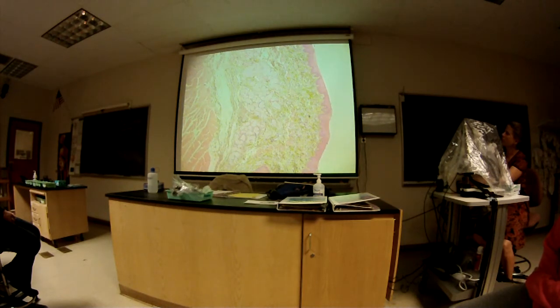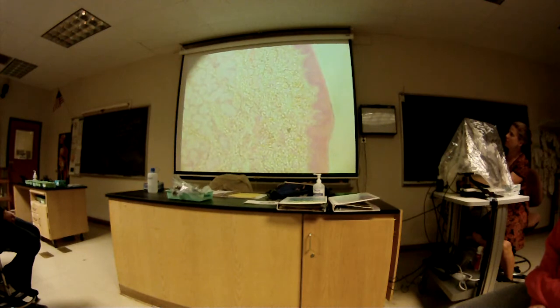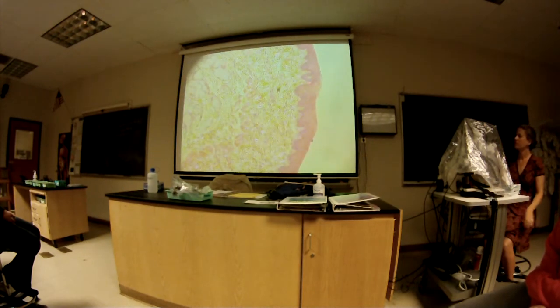Okay, so we're a little far away to tell yet what this epithelium looks like up here, but you could probably tell that it's stratified. So let's just get a little closer. Because what's the only organ that we studied on the slides that has the non-keratinized stratified squamous? This one, the esophagus. Yes, this is esophagus. And so here you can see your noteworthy characteristics, non-keratinized stratified squamous. Could still get closer, but I'm not going to for the sake of time.